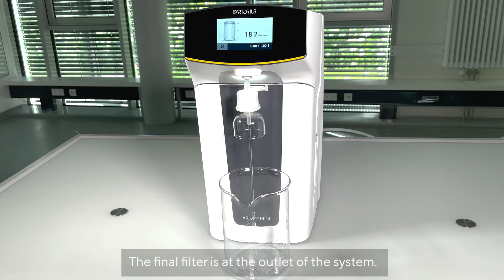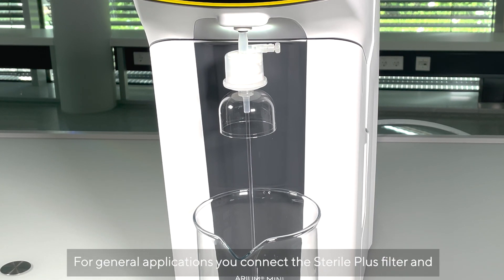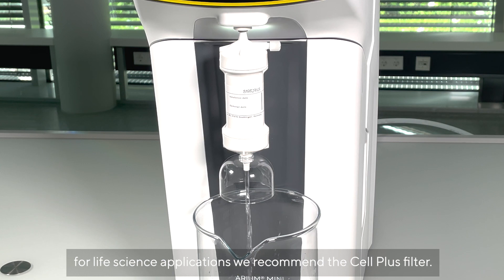The final filter is at the outlet of the system. For general applications you connect the Sterile Plus filter, and for life science applications we recommend the Cell Plus filter.